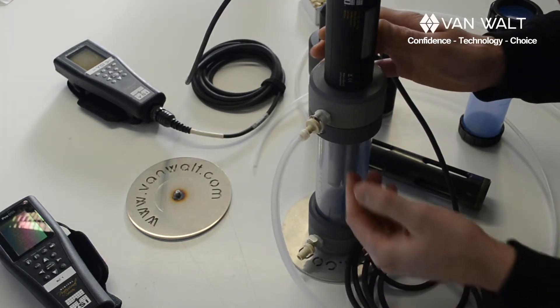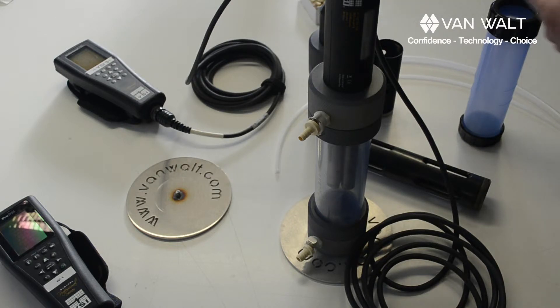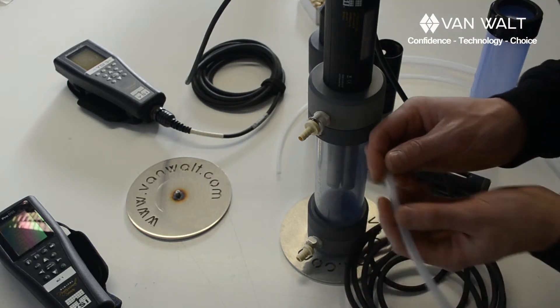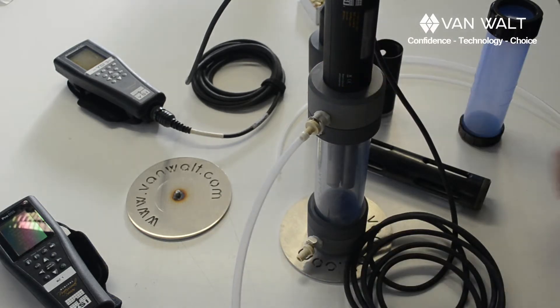If you are using a bladder pump, typically it will come with a slightly bigger sample tube. This is six by eight millimeter. This should fit directly onto the flow cell connector. And that's fine.